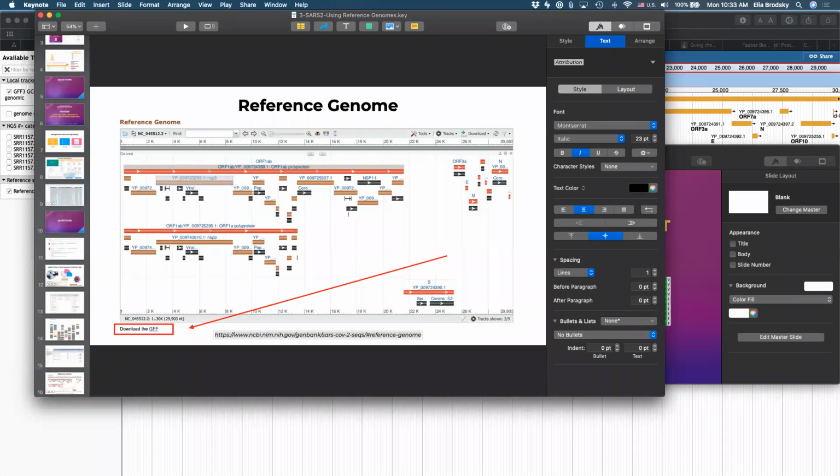Okay, I have one question. Genome-seq, which I will find on NCBI, will have COVID-19-seq and human genome sequence both together? No, you are just looking here at the reference for that virus, not the human genome, because what we gave you are reads that did not map onto the human genome. So we know that they're from somewhere else. And so we only map those onto COVID-19.